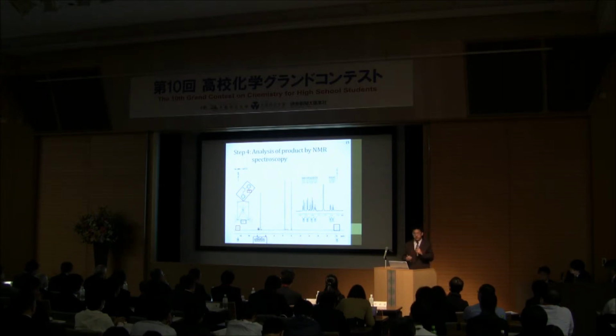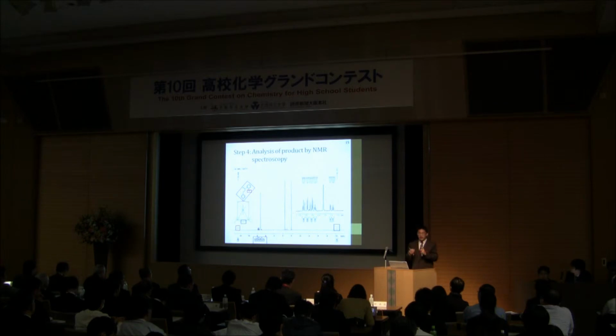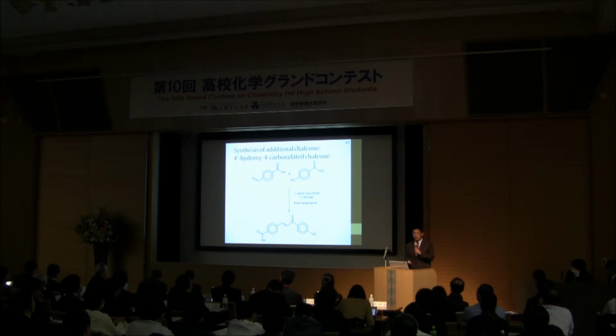So we believe we have successfully synthesized the chalcone-ligated osmium carbonyl clusters, and encouraged by this, we went on to synthesize an additional chalcone in preparation for making more chalcone-ligated osmium carbonyl clusters. So here's the additional chalcone that we synthesized. It is the 4'-hydroxy, 4-carboxylated chalcone.